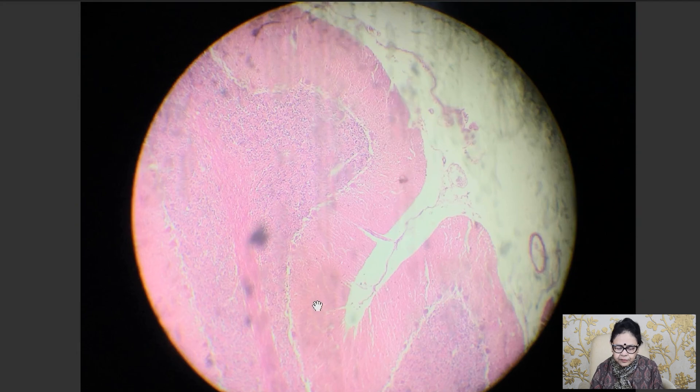This is how you can identify the slide of cerebellum. If you identify the normal slide, then you can understand the pathology or biopsy material which is supplied to you.